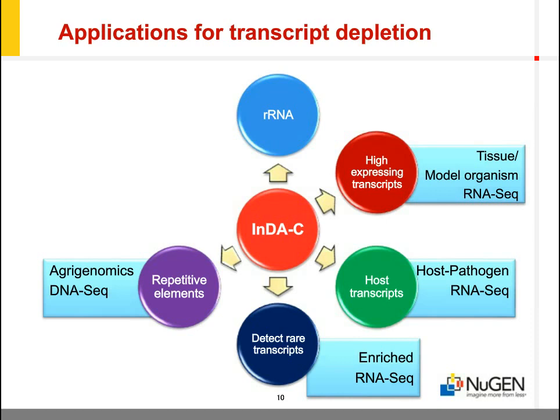Finally, chromatin accessibility studies typically suffer from a high prevalence of mitochondrial DNA reads. Depletion of mitochondrial DNA reads can increase the number of informative reads, allowing for simpler data analysis and more precise conclusions.